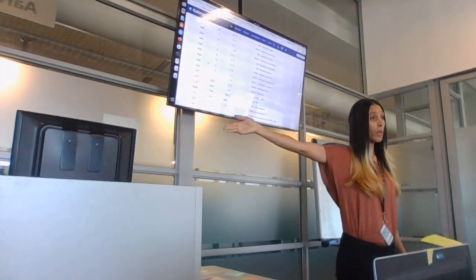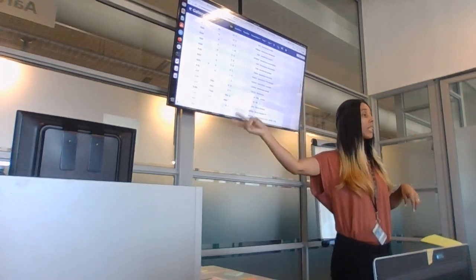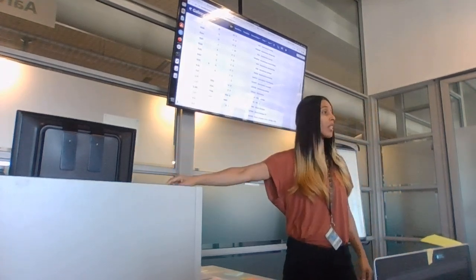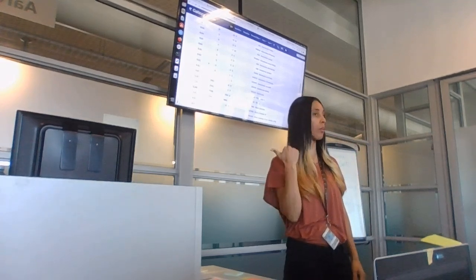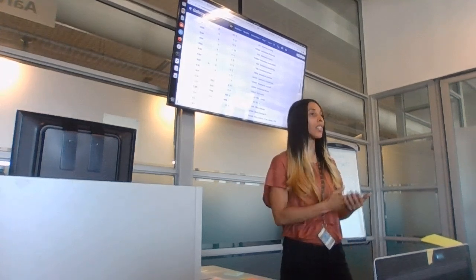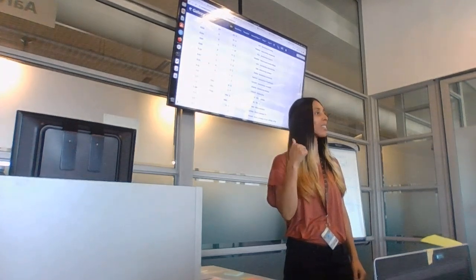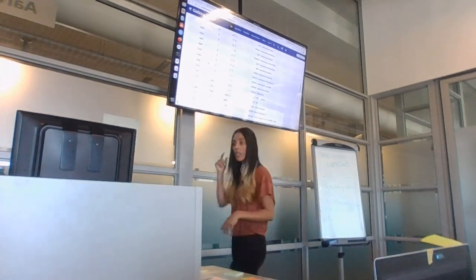They submitted, this is a preprint. This is cholera apparently. This sample has been uploaded as cholera. They didn't do a further check like Kraken, and they probably didn't even do FastQC, because if they had done any form of FastQC, they would have noticed that sample's GC content is not similar to the others. And then they didn't do another step to see this is erroneous, and because they didn't do that, they didn't see this is a common false negative or false positive.